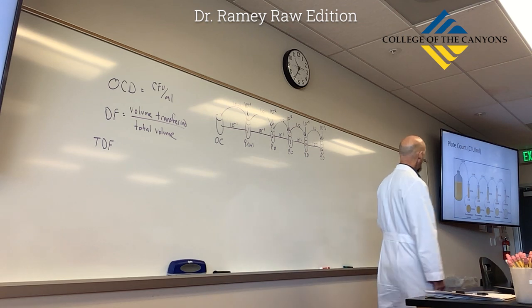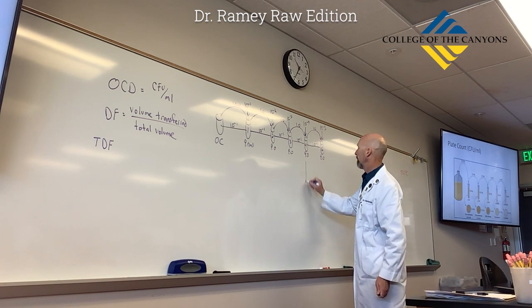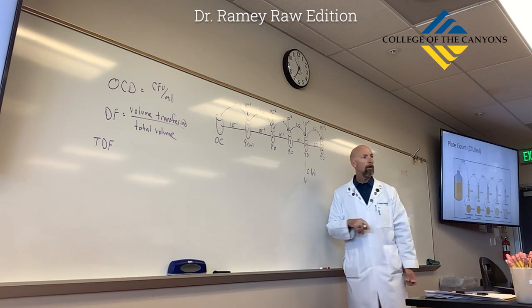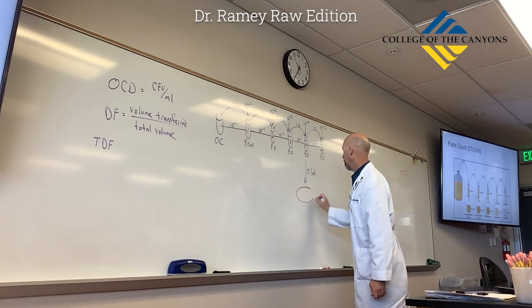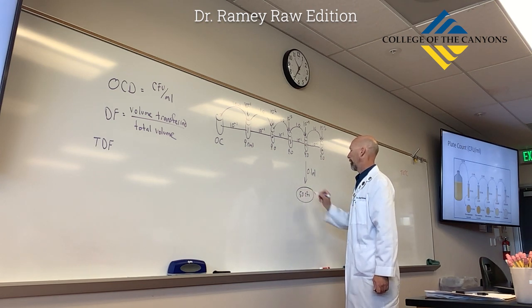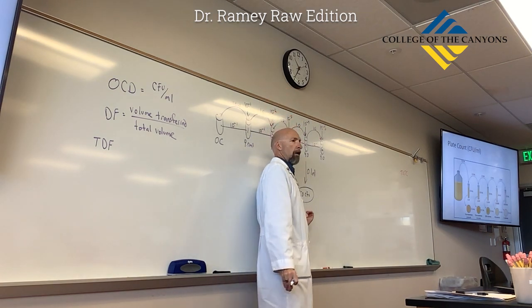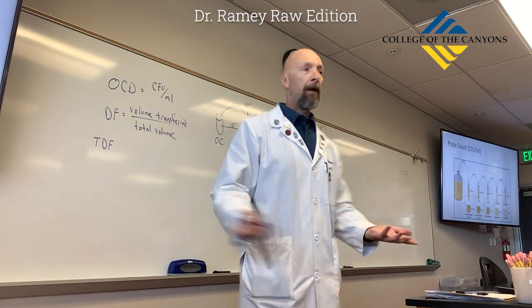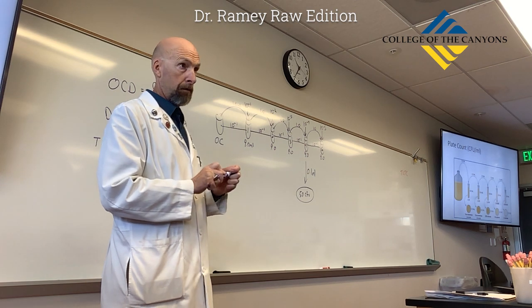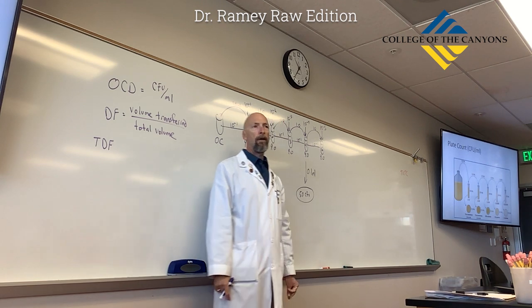And let's just look at this one. From tube number 4, you can see the plated volume was 0.1 mil. And then the plate after incubation says there were 50 colonies on it. So I'm just going to write 50 CFUs. So this is the only plate that's within our 30 to 300 range, right? 389 colonies, too many. 2 colonies, too few to use. But there's that one plate that's in the Goldilocks range, between 30 and 300.